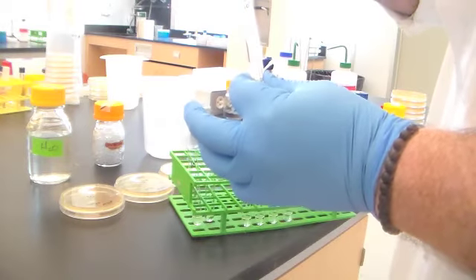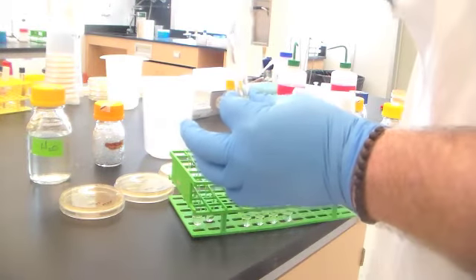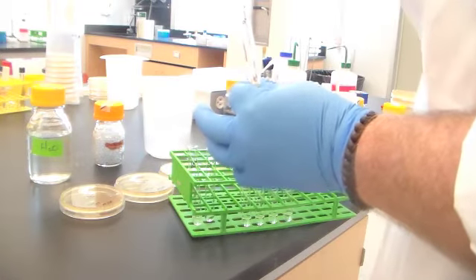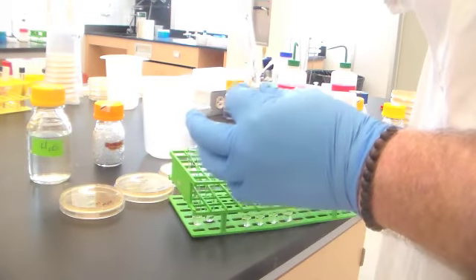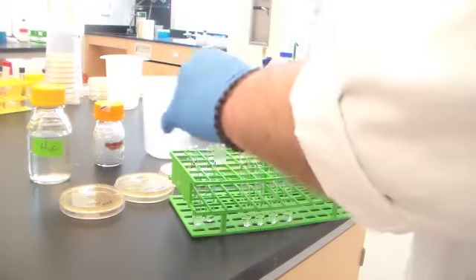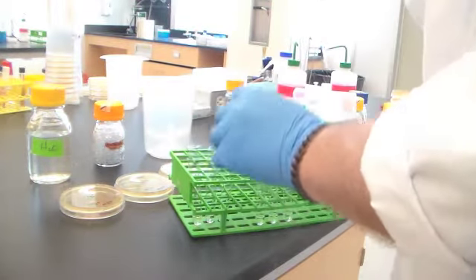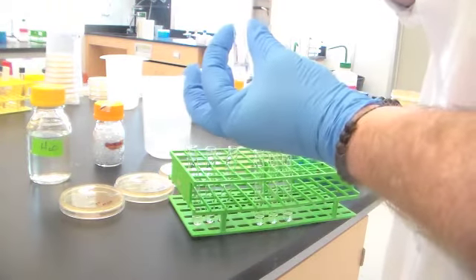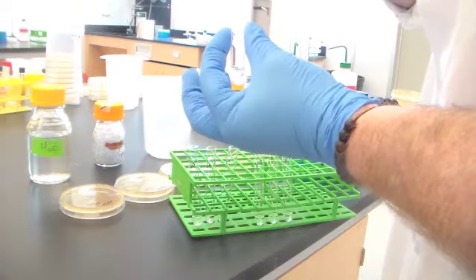As you do something as repetitive as tenfold dilutions, it's difficult not to get distracted, not to do things like I'm doing and carry on conversation, because it's very easy to forget where you are, what you've pipetted into, what you've pipetted out of.